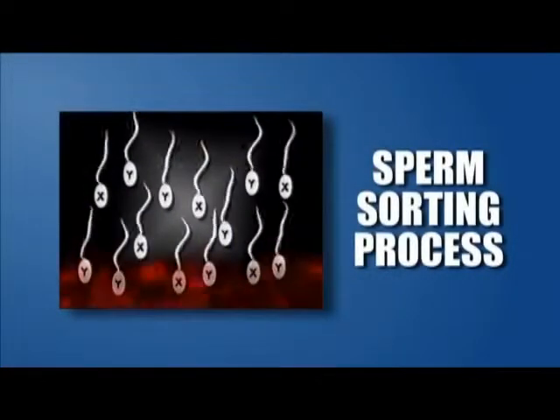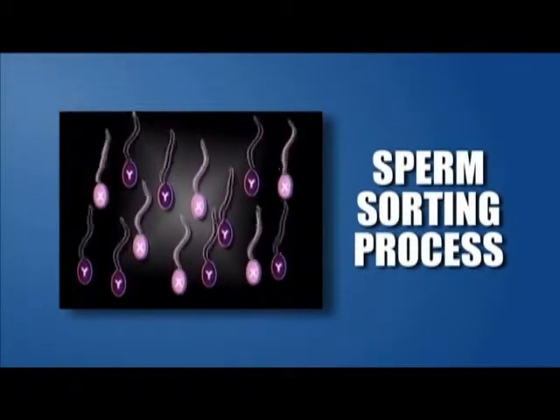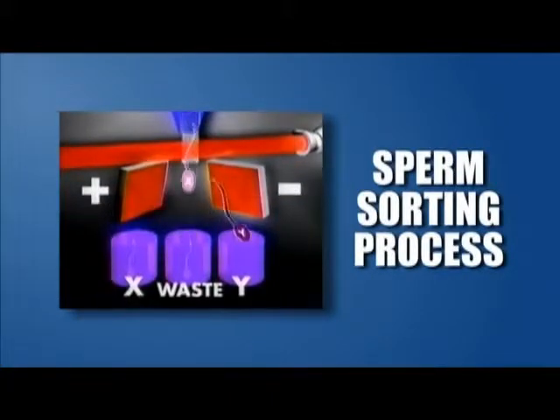The semen begins its sorting process when it passes through a piezo crystal that is vibrated at 90,000 times per second, which breaks the stream into droplets. A charge is applied when the cell reaches the last attached drop, and the charged droplets are deflected as they pass between continuously charged plates. Sperm cells not meeting the criteria are not given a charge and passed through to waste.